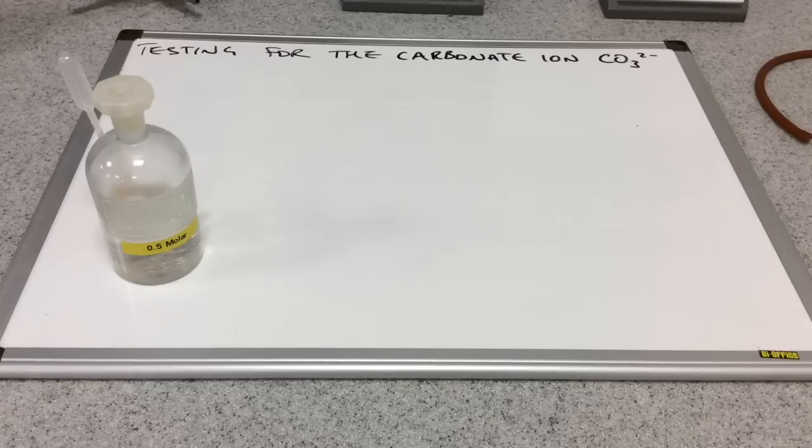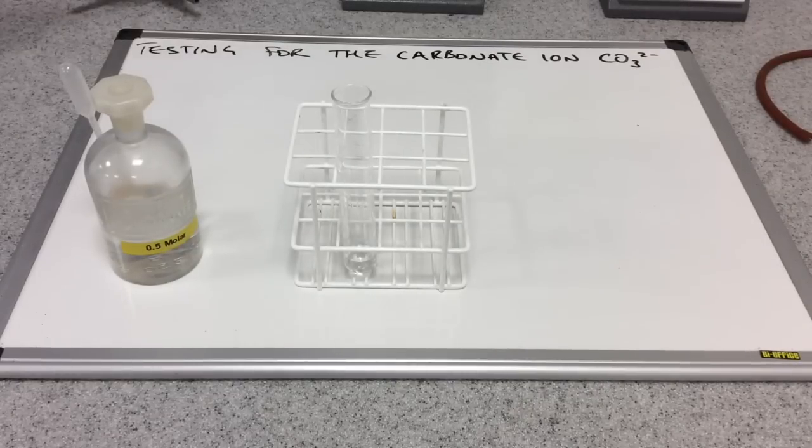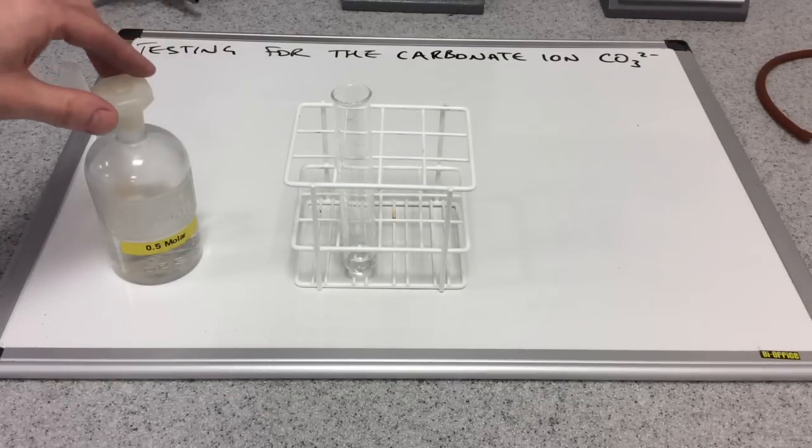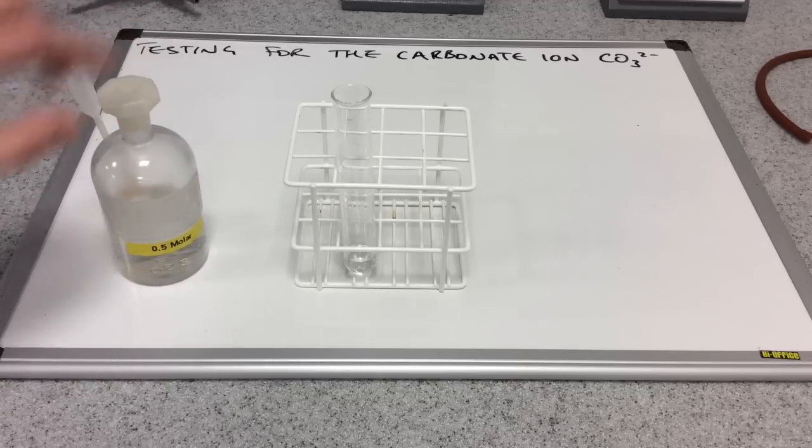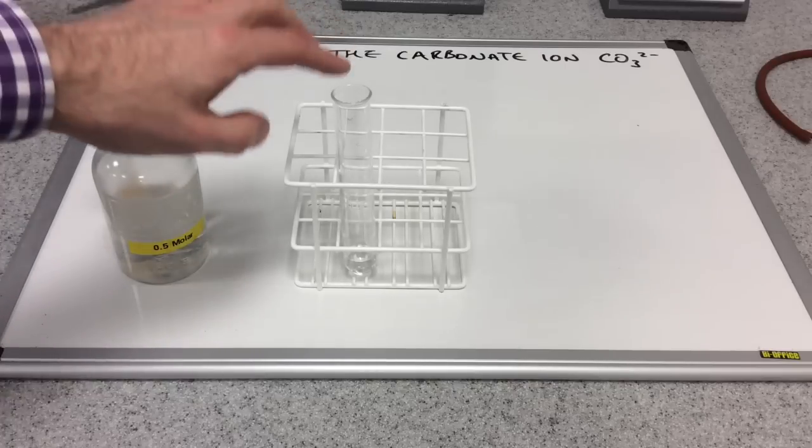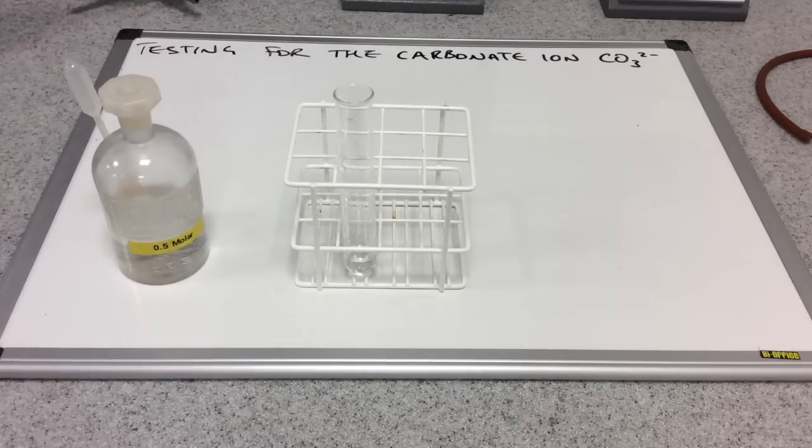In this video I'm going to look at the test for the carbonate ion. So in the bottle there I've got some sodium carbonate solution. I just hope you can read the wording there on the label. And I've put some already into this test tube.